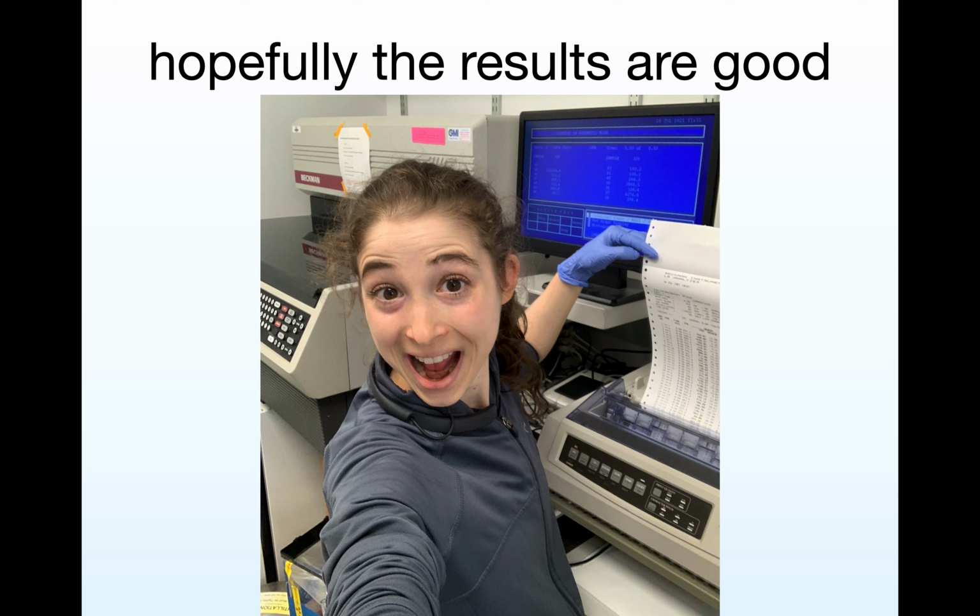There are a lot of non-radioactive kinase assays now, and they typically rely on measuring ATP or ADP instead of the phosphorylated thing. So they have more limitations and can be less sensitive, because radioactivity is super sensitive, but these other indirect methods are more susceptible to influence from non-substrate things.